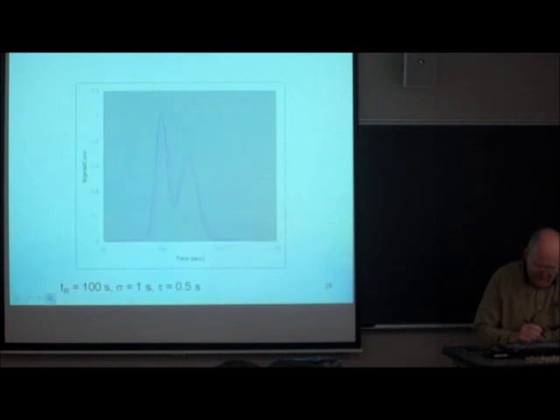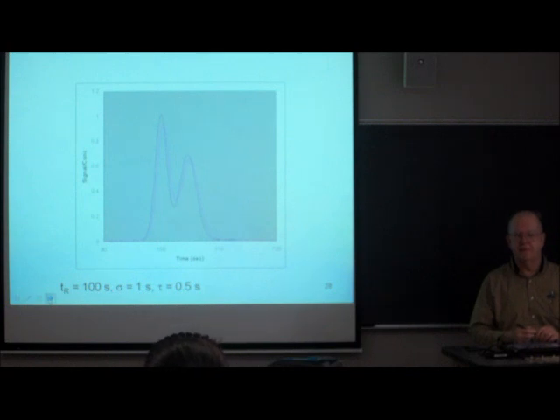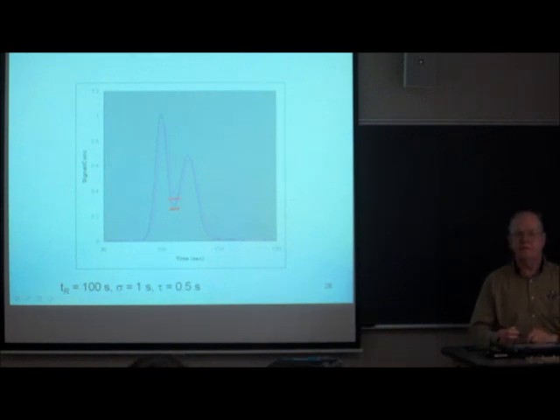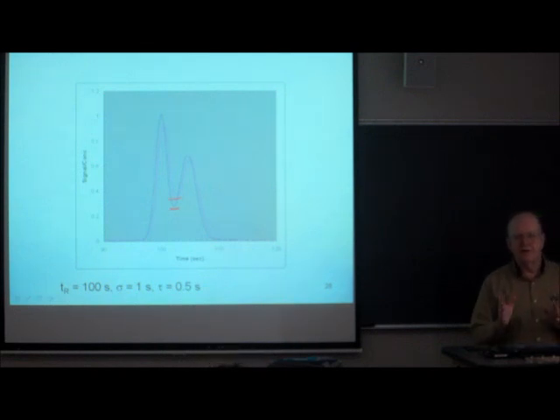And let's suppose I have two peaks that are close together. You can see that this valley here is deeper than that valley there. So if you have peaks that are close together, not only are you making the peaks wider, but you're destroying part of your resolution. And that's another big problem. So you have to set the time constant to be just enough to reduce the noise, but not so much that you screw up the resolution of any pairs of peaks that are really close together.